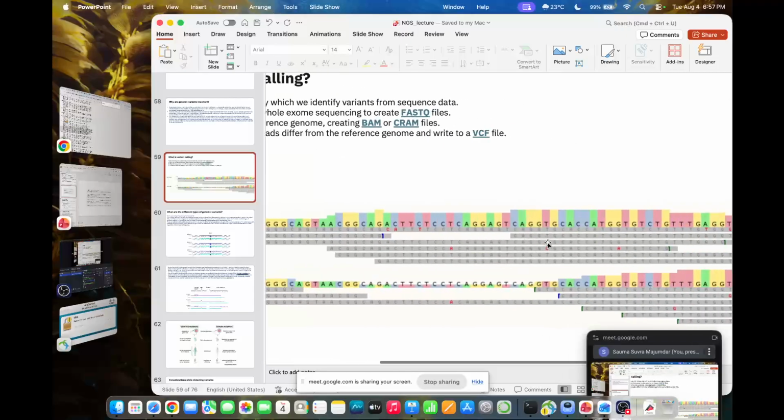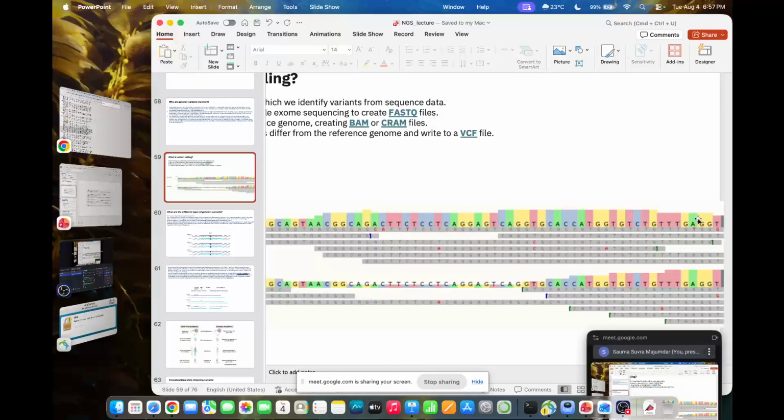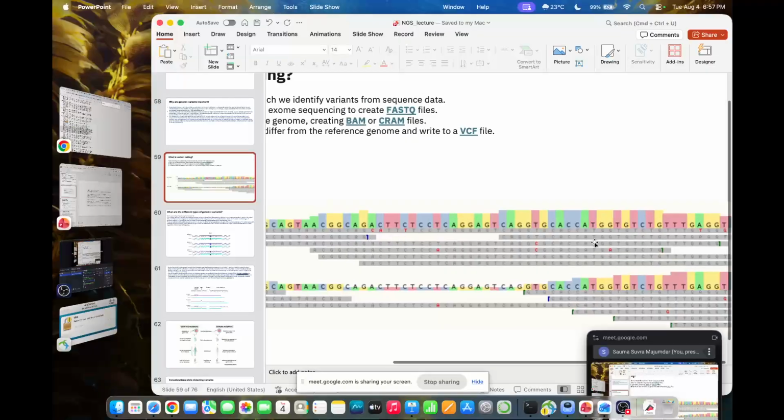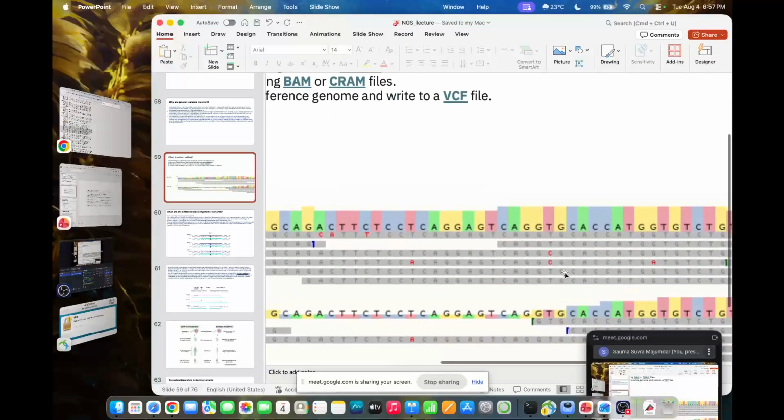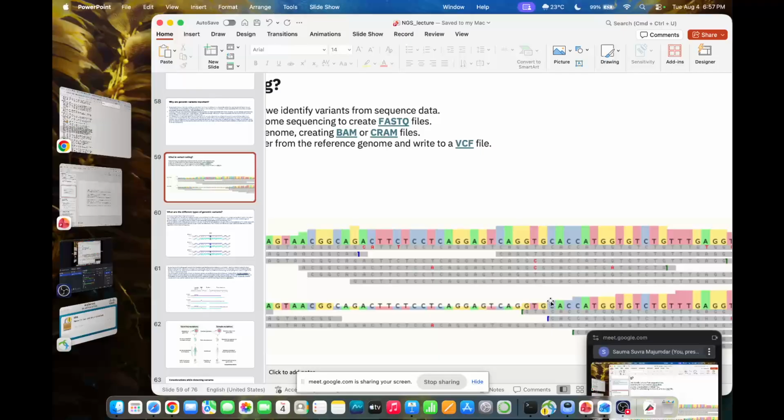So, for example, let us take this particular example. The colored bases are your reference genome. These reads have been generated from your sequencing experiment, and you see here at this particular location there are how many reads? One, two, three, four, five, six reads supporting this particular location, right? In the reference genome, there is a T, but two out of the six reads that you have generated are telling you there is a C there. This might be a mutation, right? We are not definitely sure from here. We have to check a lot of context, right?